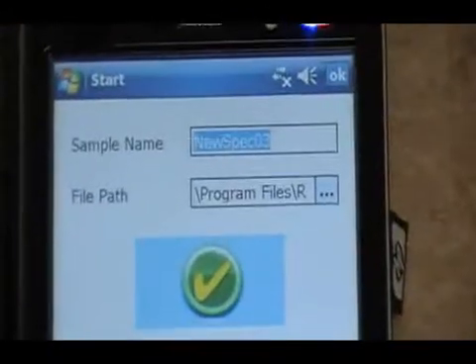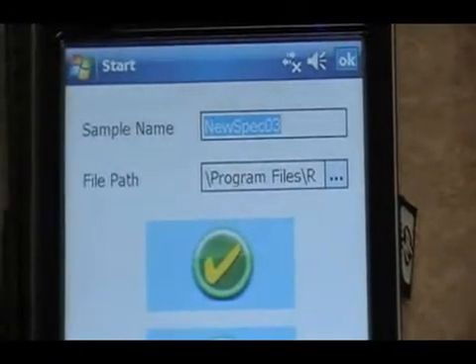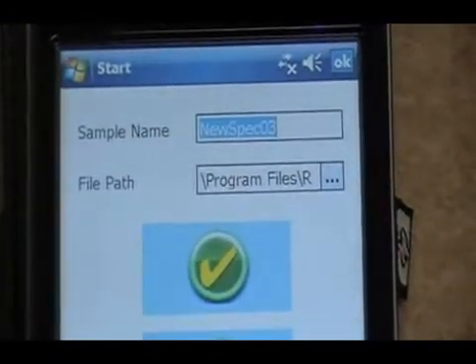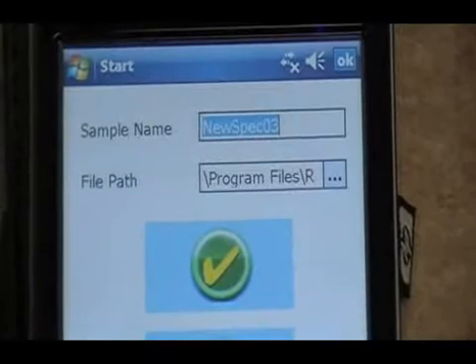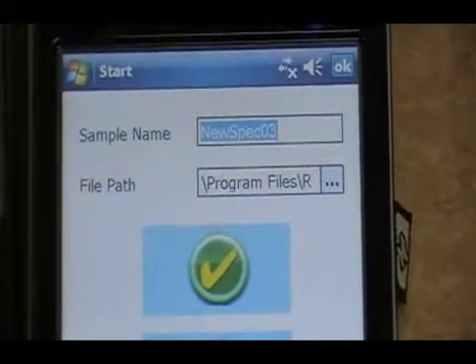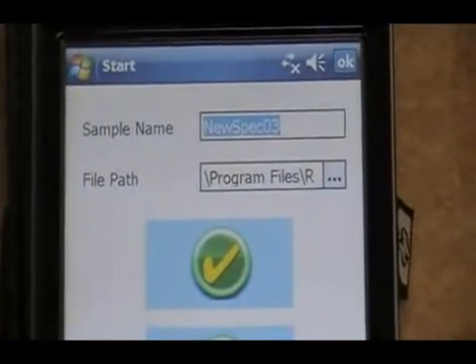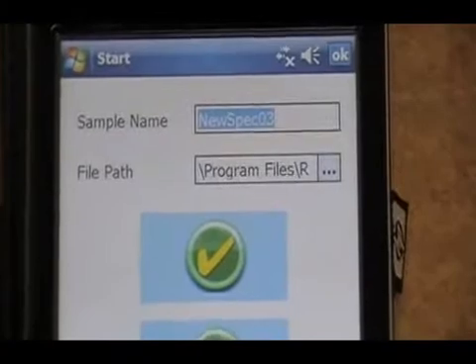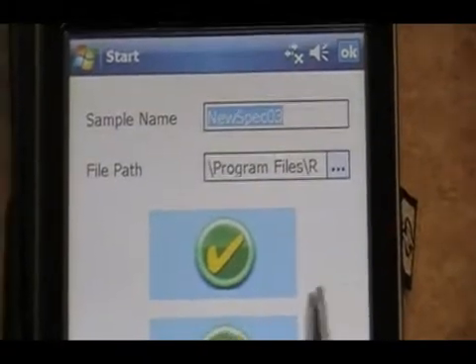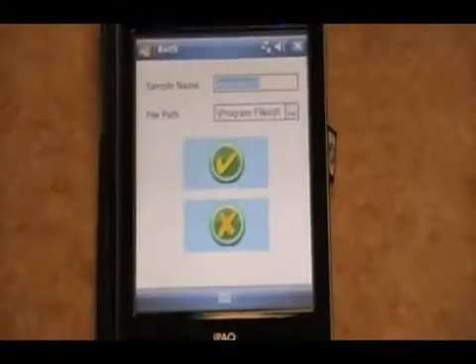In this case, I'm just going to run the program for demonstration purposes, but many times we'll put in standard PE low, PE high, or blank, depending on what we're running. Hit the check mark.